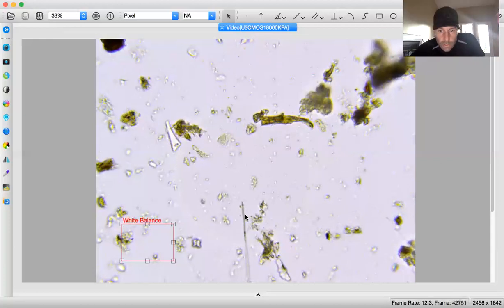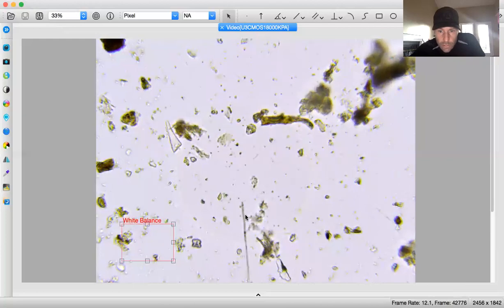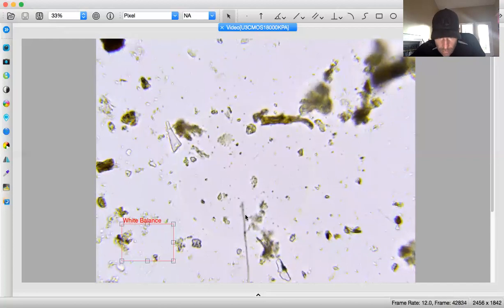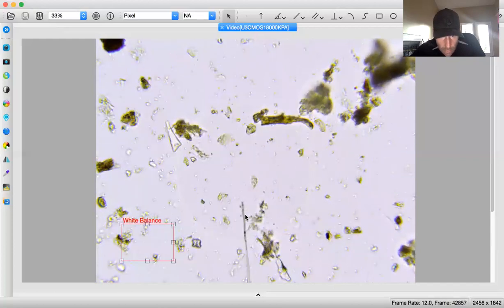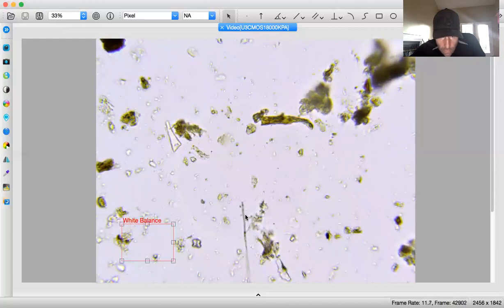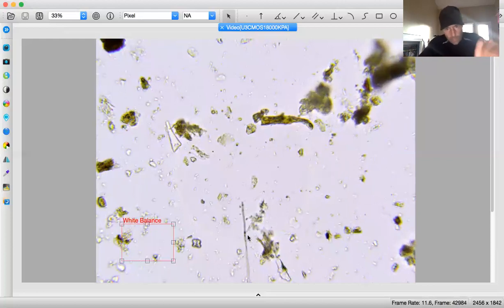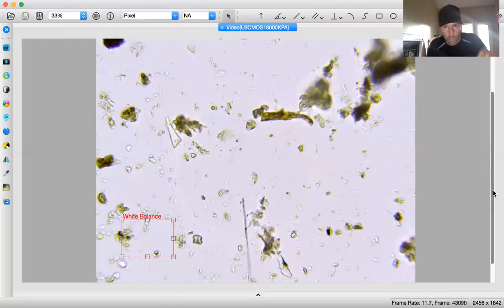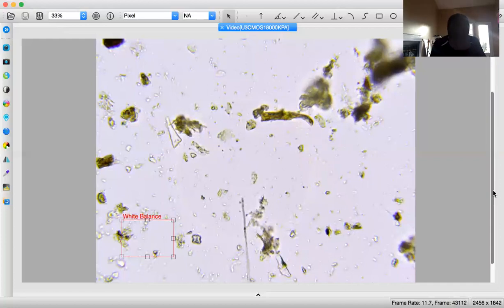Oh, there is something seriously moving quick. Oh, bacteria all over the place. It's hard to tell. It looks like it might have a flagella. Holy smokes, you guys are moving quick. So what is that? That would be about a 2, 2.5 is what I'm going to say. Never did move that back down. That doesn't matter. But yeah, we're going to say 2.5.